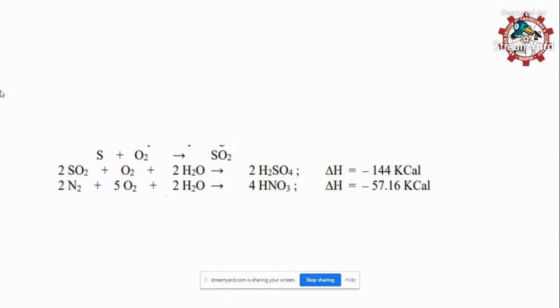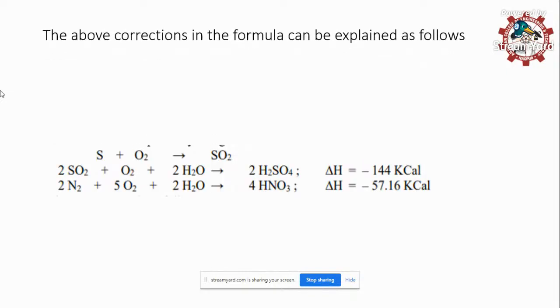Yes? Now see, let us find out how we can do the corrections individually. Fine. देखिए, हमें practically करना नहीं है, हमें वो Ta, Tt, Tf, Tc सब की values will be given to us. We just simply need to put all the values into the numerical, into the formula, and we need to calculate GCV and NCV. It is not so easy. I'm been explaining you in just simple words, but when you go for the correction, it really takes time. है ना, हमारे syllabus में corrections detail में नहीं है, but we should be aware of the correction.